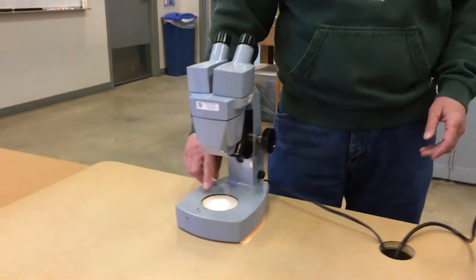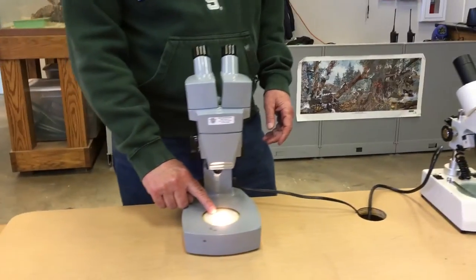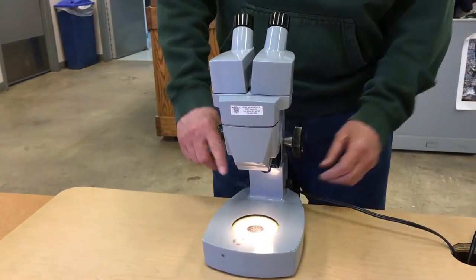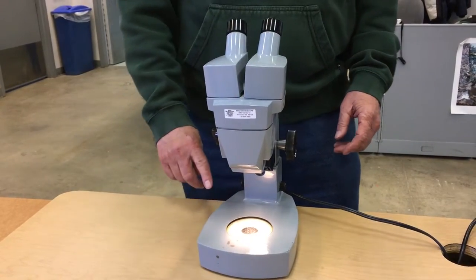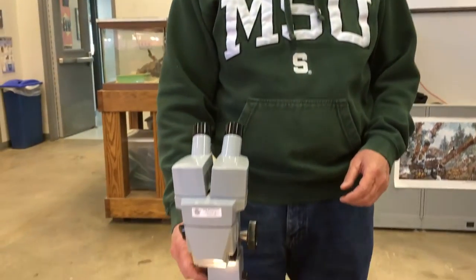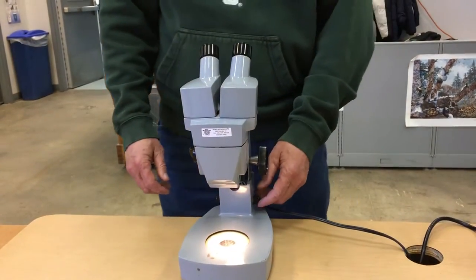It has two lights. You have a light that shines from below and you have a light that shines from above. Depending on what you're actually looking at, in many cases you want to use both lights, or in some cases just the one from above or the one from below.